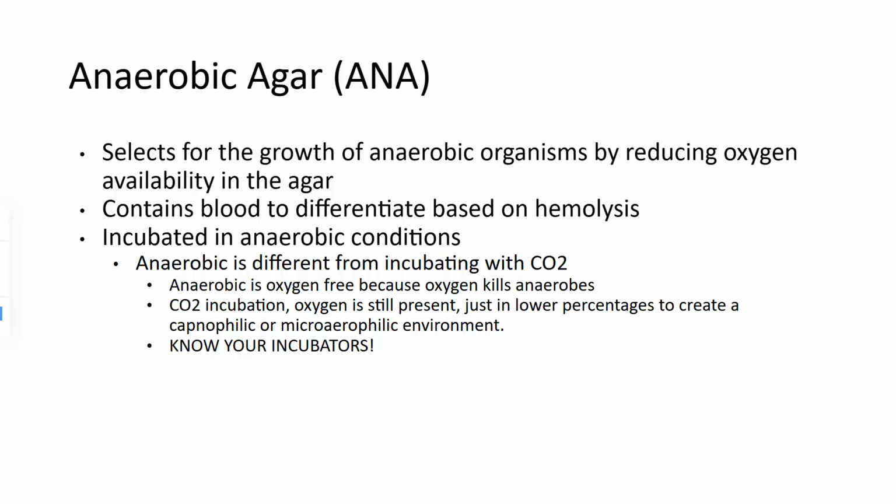Anaerobic is a whole different type of incubation system. Typically what we would do is put it in a jar or in a case, and that case can be completely sealed off from the environment, and we put in a gas pack before we seal off that case. The gas pack will exchange the air inside so that it eliminates all of the oxygen and changes the environment to an anoxic, or oxygen-free, environment. So again, very different from incubating with carbon dioxide or in the aerobic environment. And this is just a specialized medium that we use to culture anaerobes.